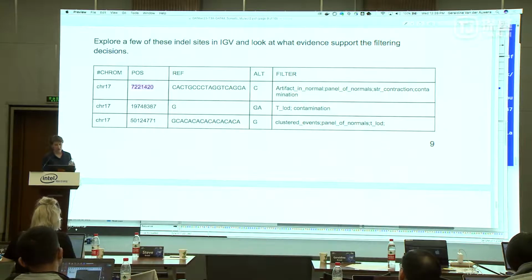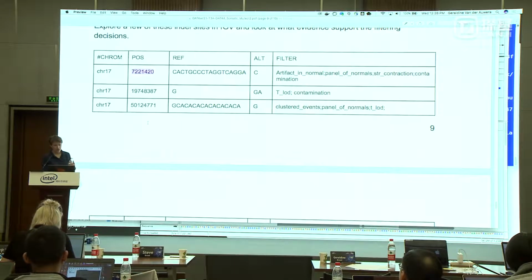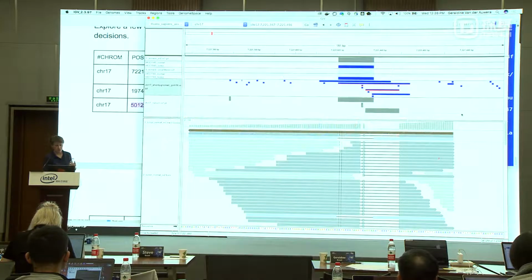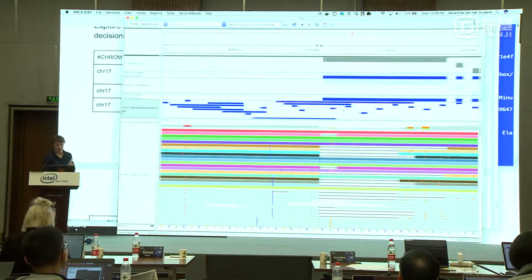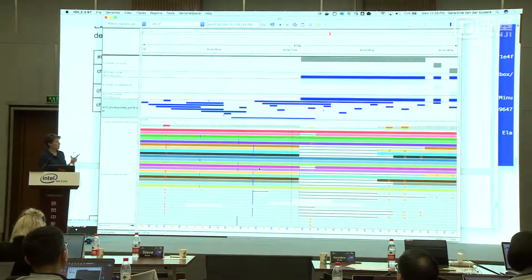Now let's look at this last one on this page 9, and then we'll have to finish for this morning. Now this one, when you see something like this, it's very colorful, RGB.